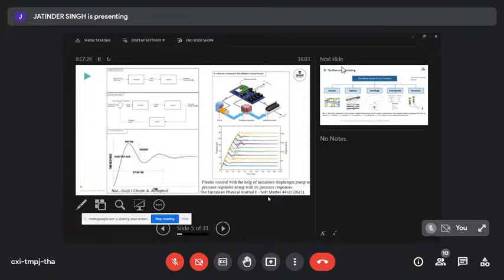The best performing system that we found in literature, doing a very thorough search, was the one that we've got cited here. It was published in the European Physical Journal E of Soft Matter, which was a little pneumatic pump that had a home-built pressure regulator in there that was then connected to fluidic solenoid valves before being connected to the fluidic system. And that allowed for the most accurate flow control and the most stable flow.